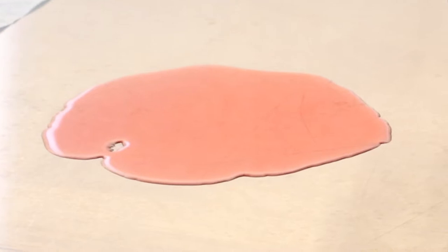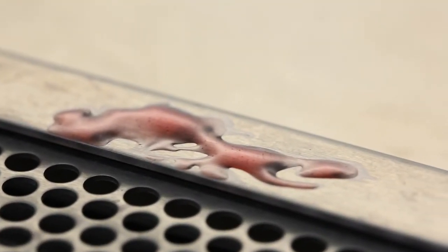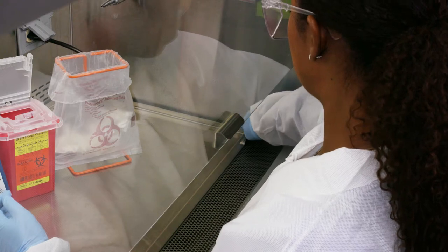Cleanup of large spills, or spills that occur in parts of the BSC that are difficult to access — for example, the drained spillage trough or catch basin — may require assistance from the safety office.